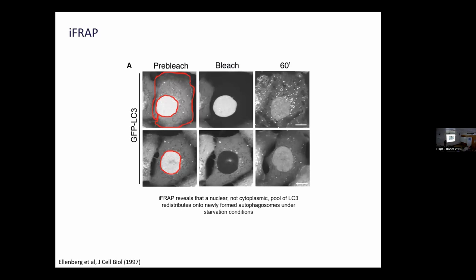Any questions so far? So there are also other variants of FRAP that were developed at the time, once people started exploring the dynamics of molecules. iFRAP, for instance, is the inverse FRAP. Instead of bleaching an area, you bleach everything else except that area, and then you look at the recovery.